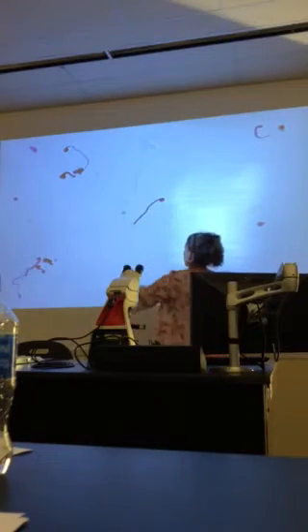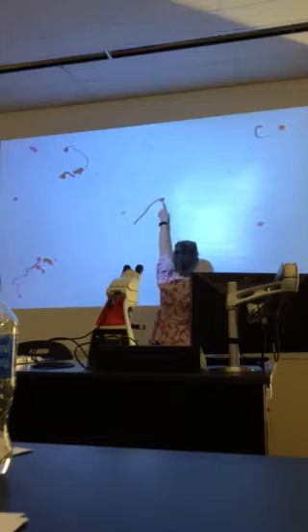So then let's see. Who do I want to look at? No particular order. I am just finding them and doing them here. Let's do some of the simpler ones really quickly. What is this thing right here? That is a pollen grain.